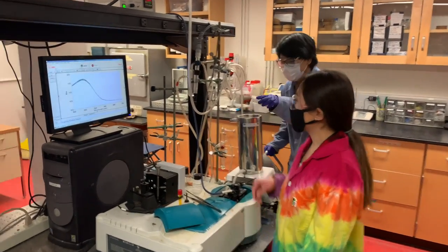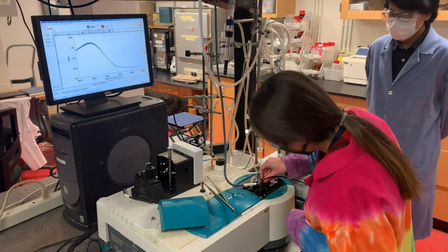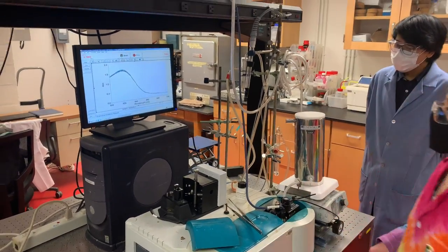We set the temperature to negative 40 degrees Celsius, drop the UV-vis cuvette inside, and here's the resulting spectra.